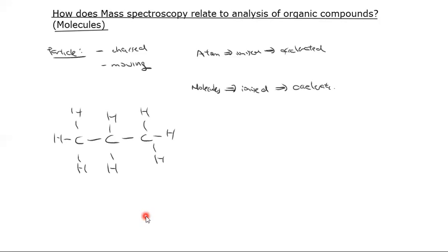So it'll lose an electron, and it'll become positive. Now, is this stable? No, not really. It's not very stable. Exactly. So now, granted, one of these bonds lost an electron. Doesn't matter which one, but it's one of them. Now, granted, in mass spec, they're moving at very fast speed. So maybe it just gets to the end and gets detected anyway, just like we said, nothing happened.